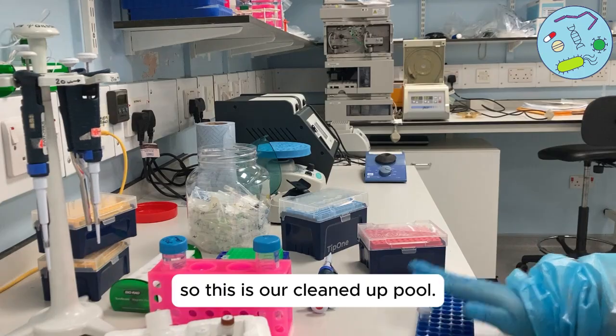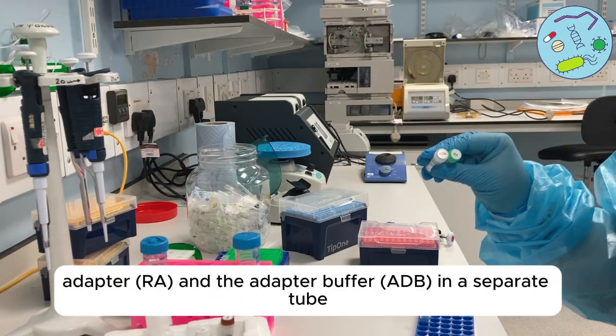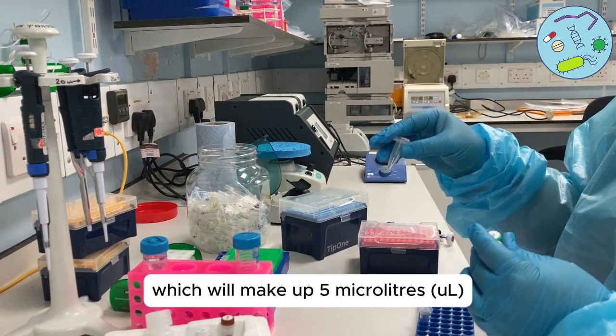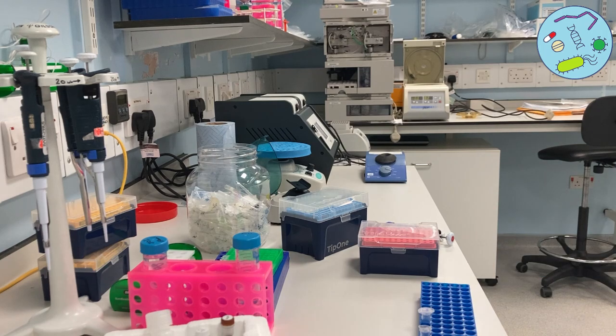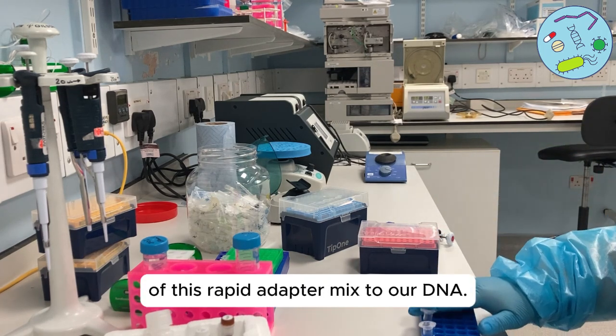This is our cleaned-up pool. The next thing we need to do is make up the rapid adapter and the adapter buffer in a separate tube, which will make up 5 microliters. We then need to add 1 microlitre of this rapid adapter mix to our DNA.